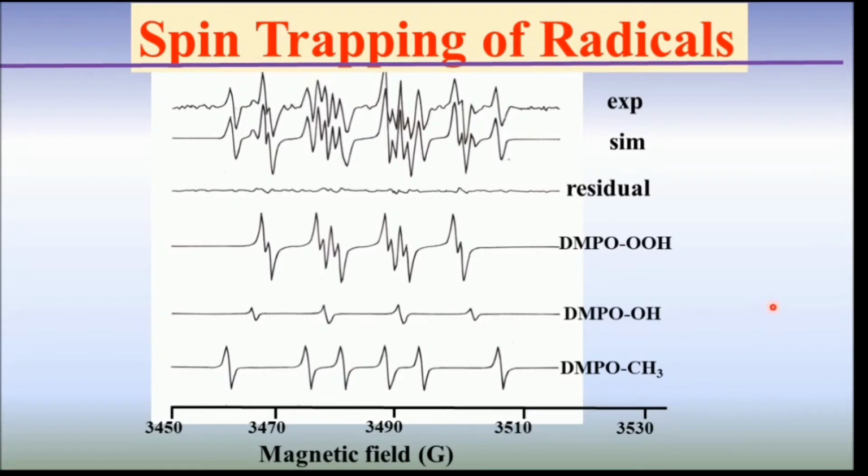I have shown how the ESR spectra are simulated. Using spectral simulation, we are able to suppose a mixture of free radicals formed. Using simulation, we can determine the radicals from experimental spectra.